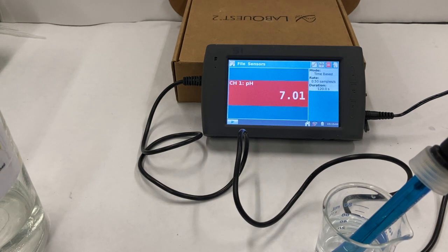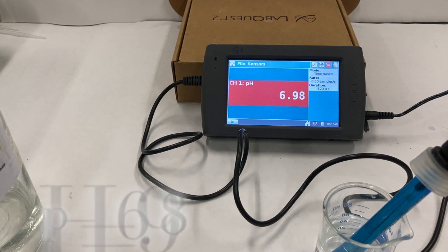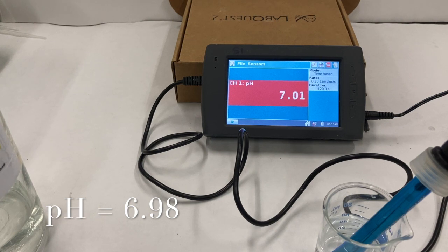Get this to settle exactly at 7. That's good enough. We'll go with 6.98.